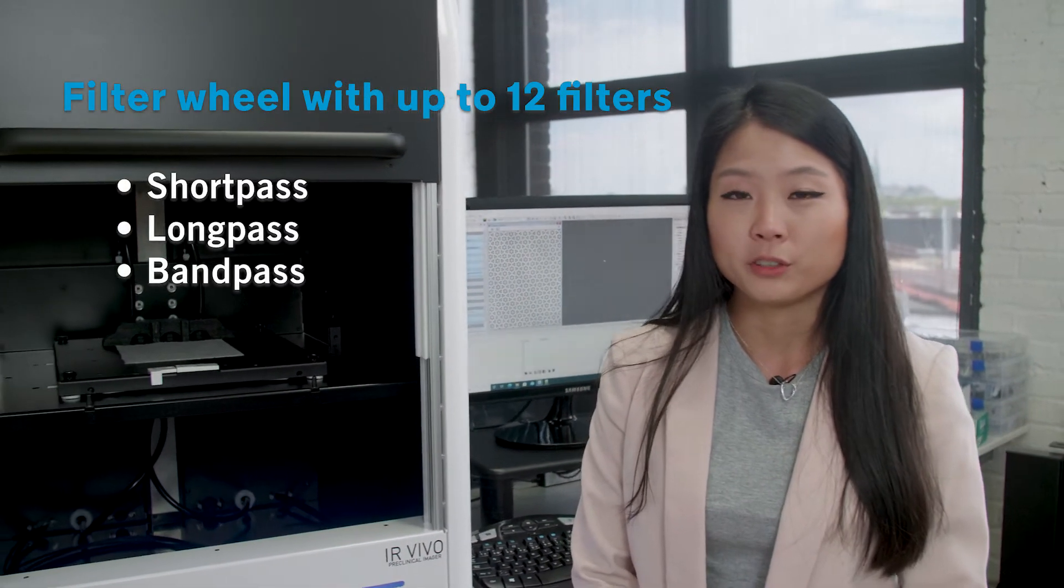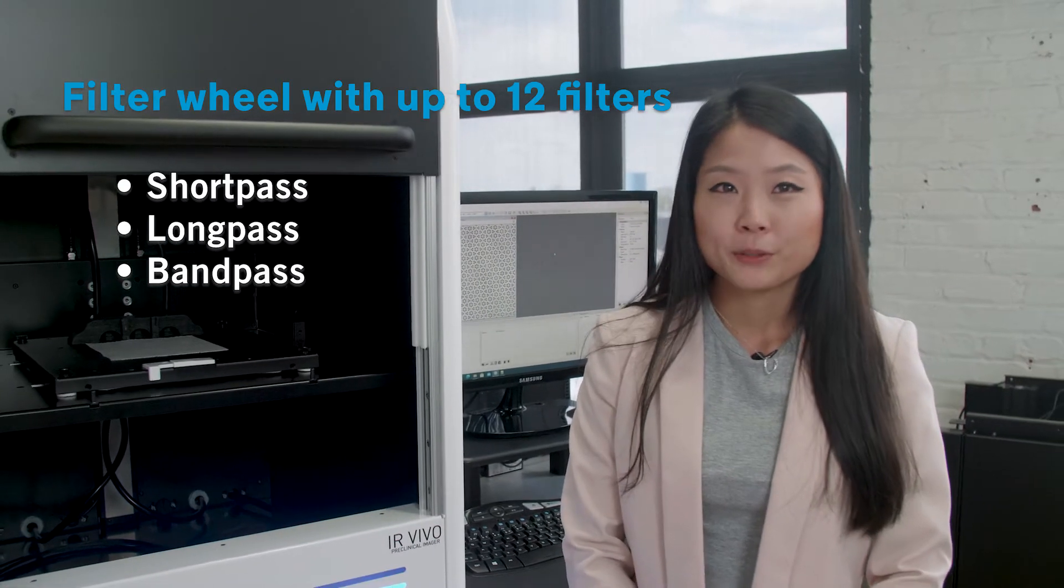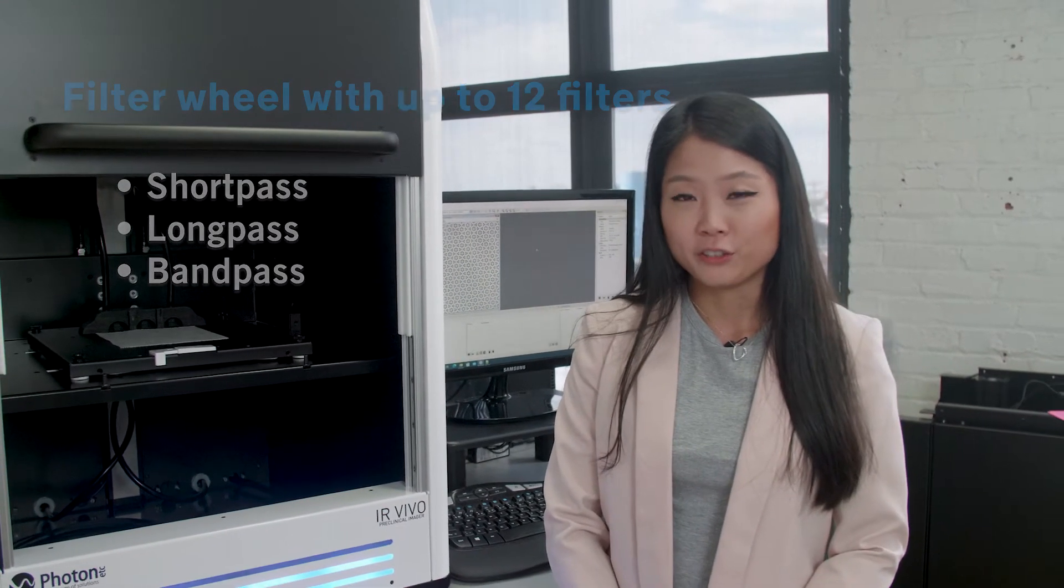We also have a filter wheel that can hold up to 12 different filters, band pass or long pass. Our team of experts can help you find the right configuration.